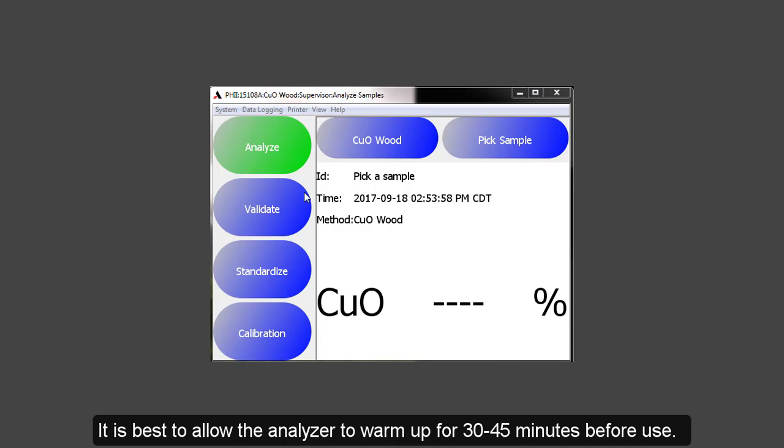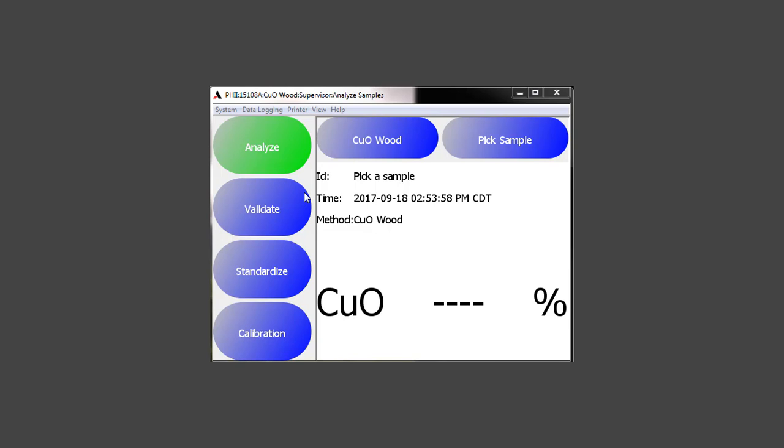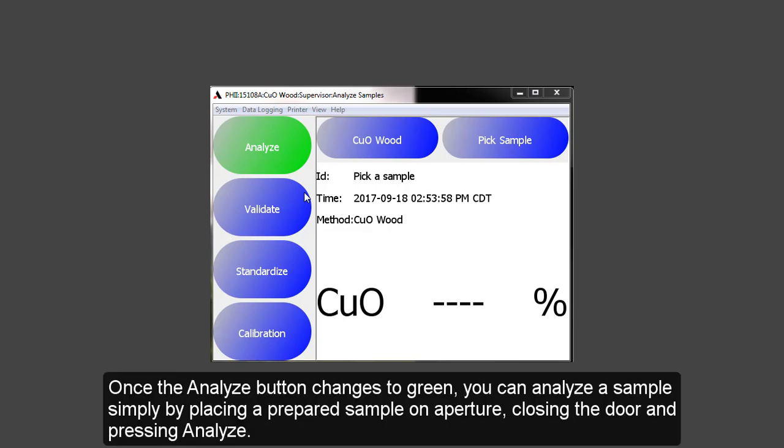Once the Analyze button changes to green, you can analyze the sample simply by placing a prepared sample on the aperture, closing the door, and pressing Analyze.